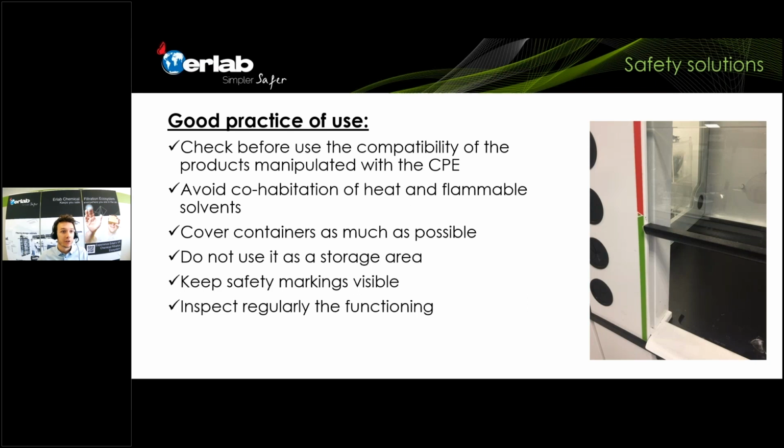Some other do's and don'ts is, of course, check the compatibility of the products that you're going to use with the hood or the material of the fume hood. The fume hood, for example, has a Trespa worktop, or a tempered glass worktop, or a stainless steel one. These materials will react to some chemicals. So think about that as well. Which chemicals am I going to use? And are the materials in my safety solution adequate? Are they not going to be damaged by using these chemicals?